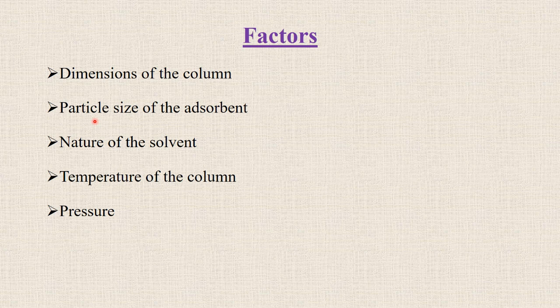Similarly, if the particle size is very small, then the solvent will take a lot of time to elute from the stationary phase or the column, so the separation will be better. And similarly, the nature of the solvent depends upon the mixture components, then the temperature and the pressure. If the pressure is high, the solvent will flow more easily and the separation will not be better.